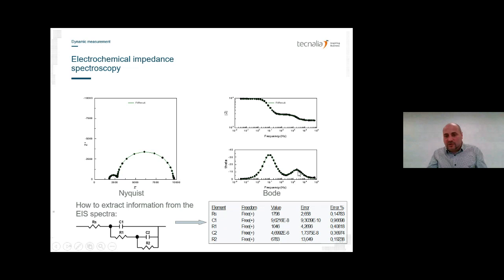And here we are going back again to something close to zero. That is a resistance also. That is going to be, in this case, the resistance of this semicircle that, if it's, for example, a porous material on top of a metallic material, is going to be the characteristic of the material. And then we have another plateau here that is going to correspond to this value, when we have a zero phase.